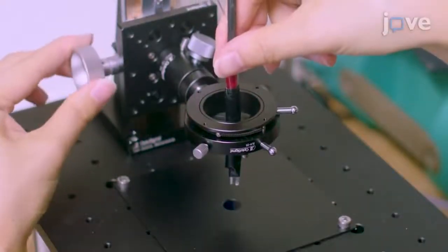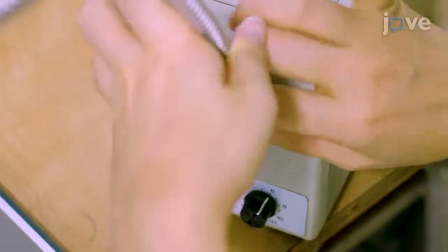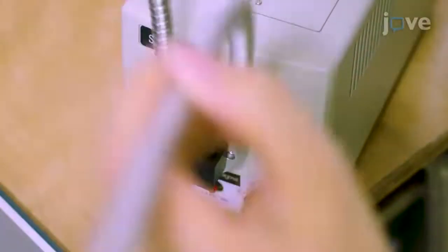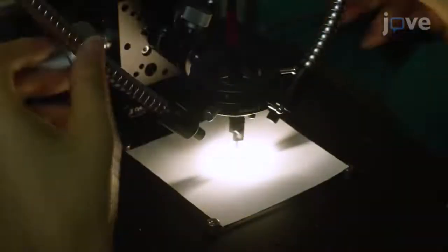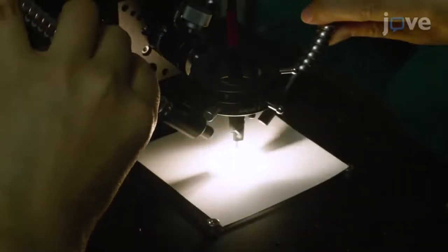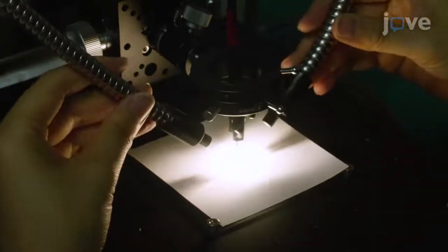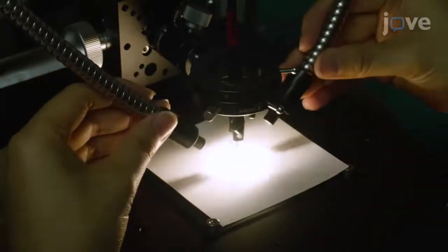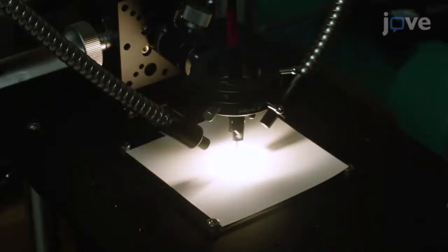Position the probes vertical to the sample stage and attach a biforked light guide made of glass fibers to the halogen light source. Then irradiate the sample stage from both directions at approximately 45-degree angles, adjusting the light source so that light uniformly illuminates the sample stage without casting shadows.